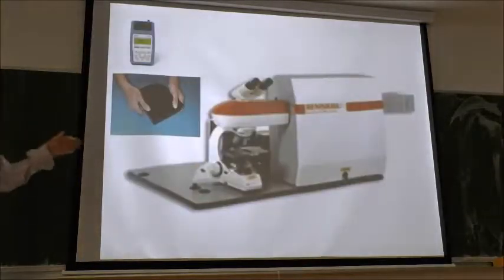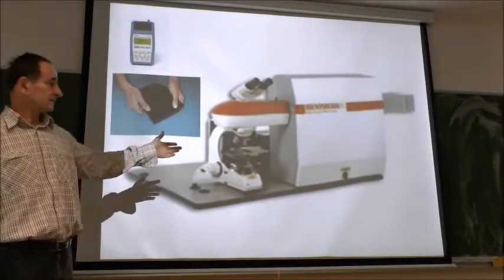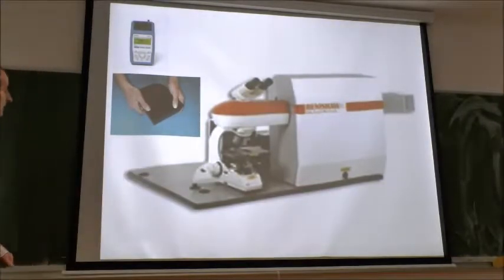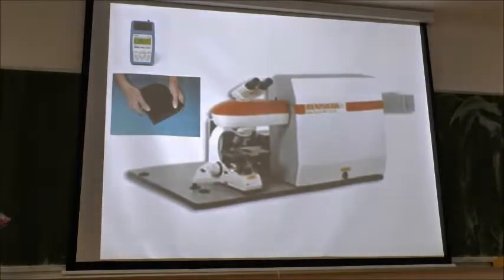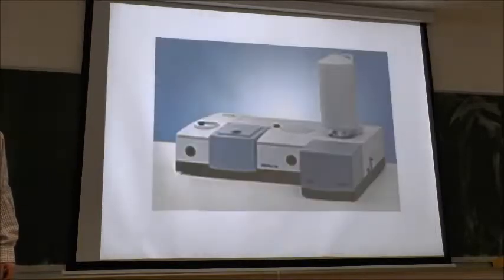Here we have the desktop or benchtop design. This is sold best for years, and also handheld devices, which really are small, quite efficient. They are used by the army, by geologists. They are small, but the price is not so small, so it's comparable to the benchtop.